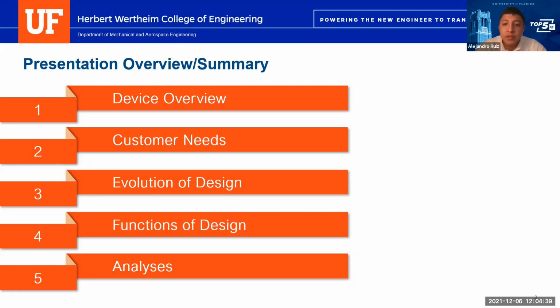This explanation will demonstrate why changes were made and will show the physical changes that were performed. The functioning of each of the separate parts will then be explained individually, as well as how they work together as a system for the micropipette to work as designed. And finally, the mechanical analysis that was performed will be explained to demonstrate that the micropipette will not malfunction under the correct circumstances.